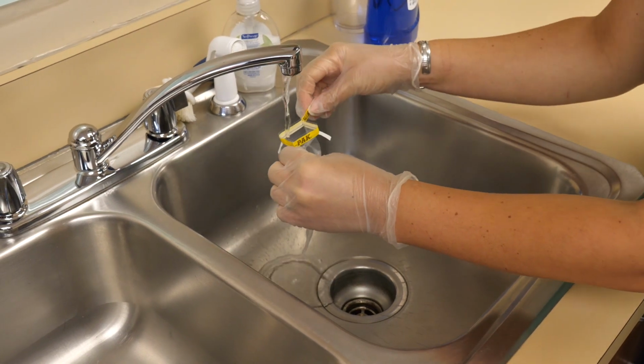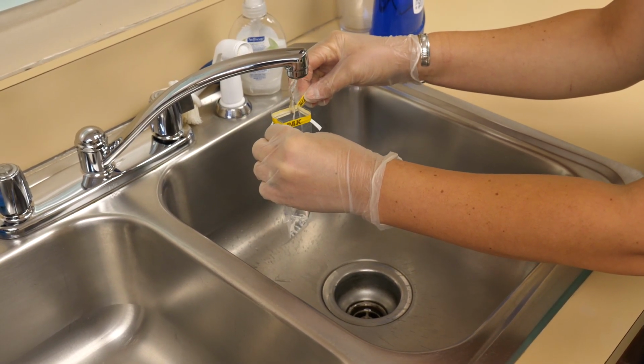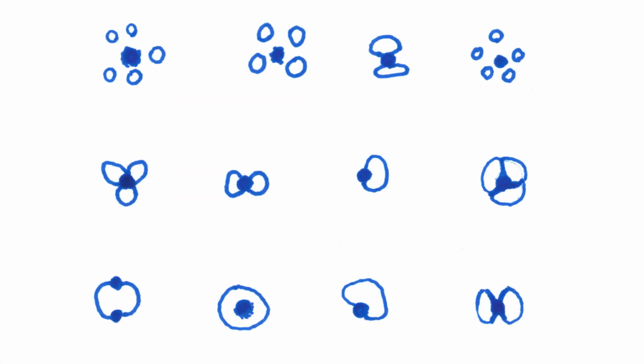Resample your tap water or blank source immediately and contact your water supplier or disinfect your well if colonies continue to show up on the blank sample. If your blank is clear, you can move on to counting colonies on your sample plates. E. coli colonies appear blue and have a gas bubble. The bubbles can be any shape or size, and some colonies may have more than one bubble associated with them. Note that you may see colonies that are blue with no air bubbles.